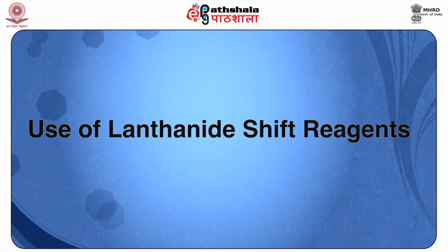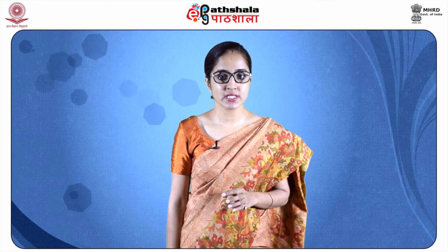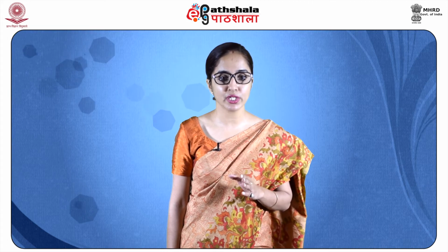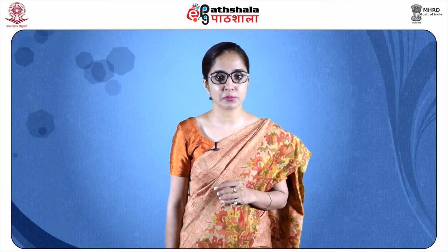Now students, let us come to the topic of use of lanthanide shift reagents, which help in simplifying the NMR spectrum. The lanthanide shift reagents were first introduced by Hinckley in 1969. When such reagents are added to the compounds which are under investigation by NMR, there is a remarkable shift in the resonance positions of the protons in the molecule without increasing the strength of the applied magnetic field. That is, a second order spectrum is generally converted into the first order spectrum.